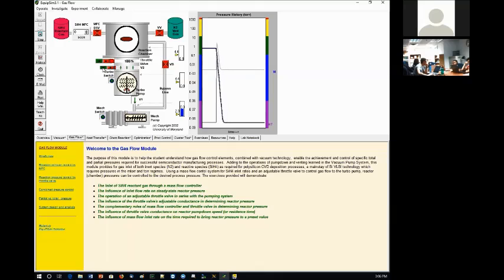All right, now, of course, when I open that up, it makes the chamber pressure 10 to the minus 9. Will any chemistry take place at 10 to the minus 9? Will any plasma be sparked at 10 to the minus 9? No, no, these are too low numbers. So I need to increase the pressure inside the reaction chamber.